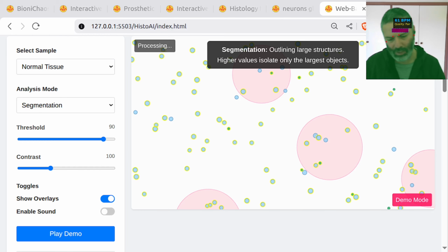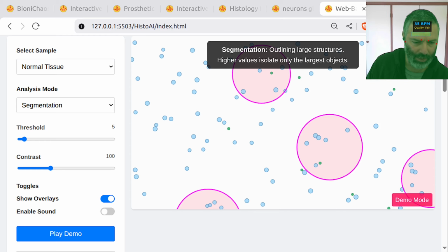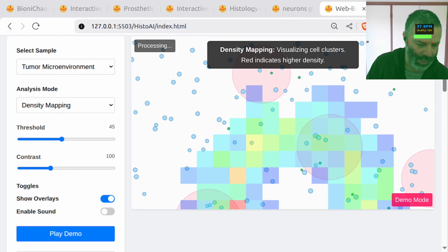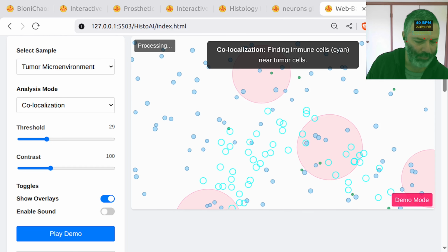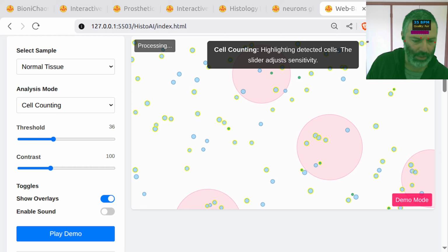No, that's fine. So I get it's generating synthetic data. That's perfectly okay. I'm asking if the analysis is actually correct. So is it actually taking the simulated data and processing it properly? Can you comment on that?